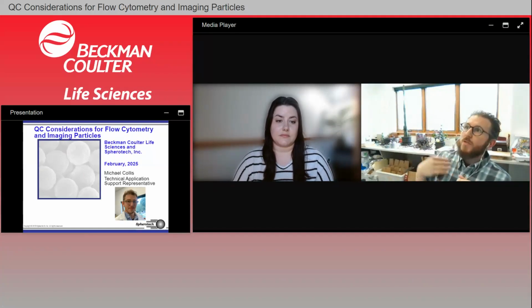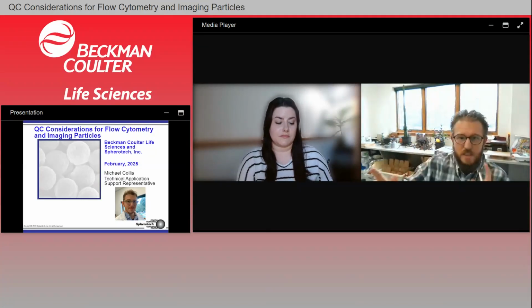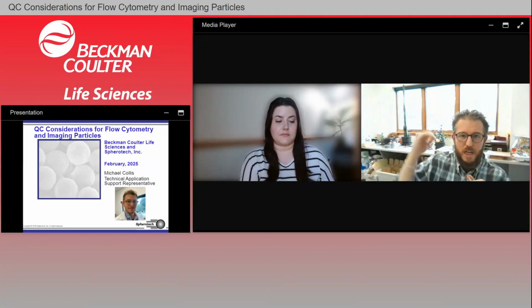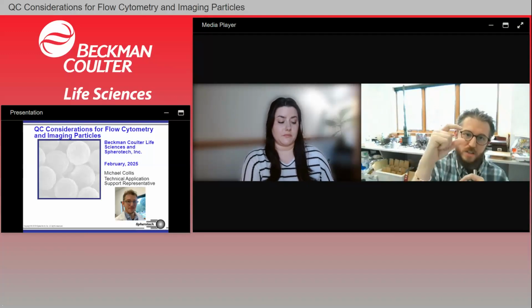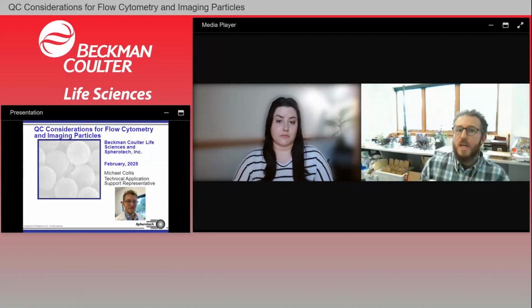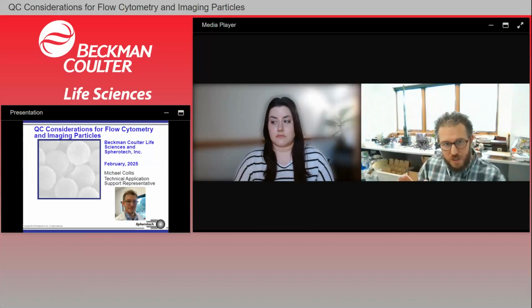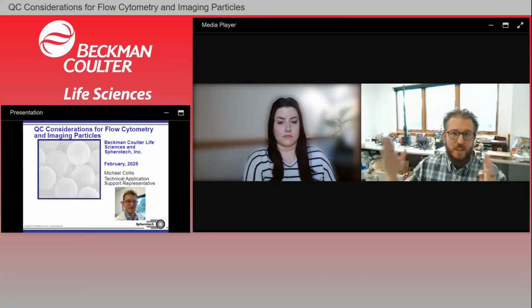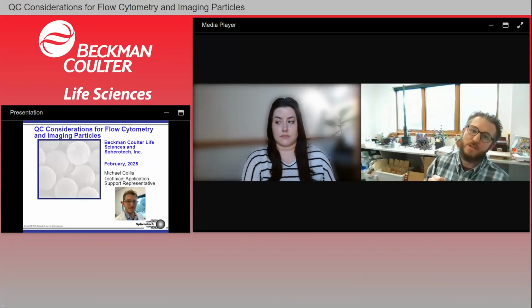Now, again, my mentor did make a very cool and robust adjustable filter parameter template that is available on our website. Near the bottom of that template's homepage, there's one for the URQP. So you can literally type in, my filter is this and this, like it starts at 520 and ends at 575. And it works much of the time, not all of the time, because there's only so much data that NIST provided to us, but it is more robust than what may appear narrow on the certificate.